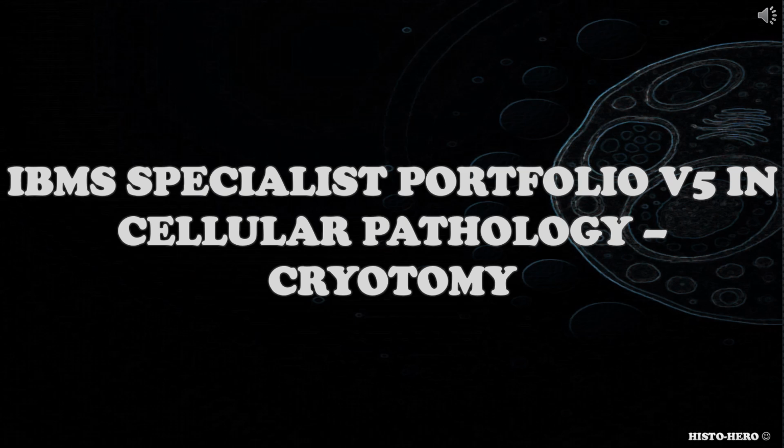And today's video will be about cryotomy, which is part of the IBMS specialist portfolio in cellular pathology.